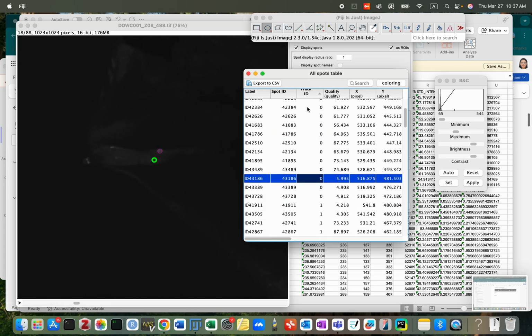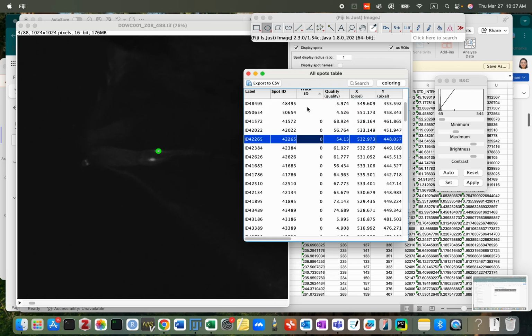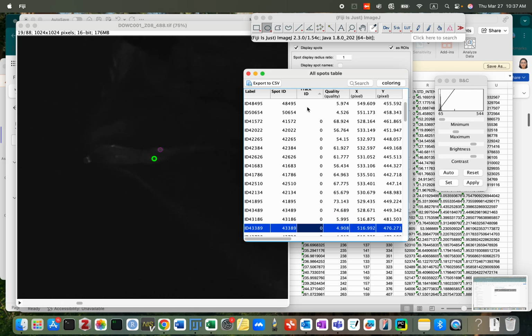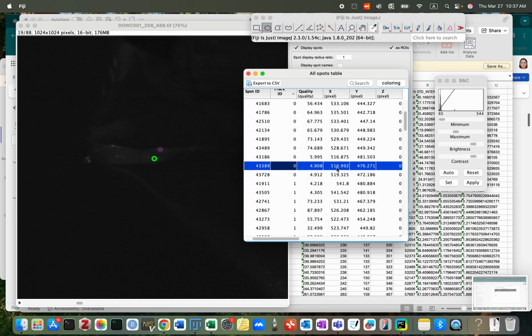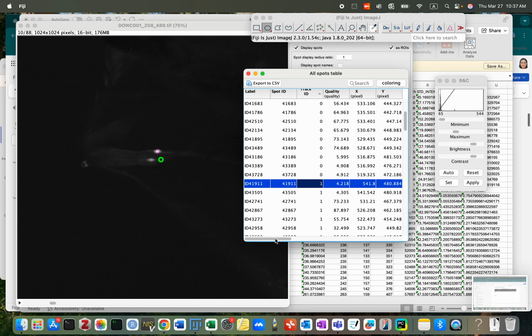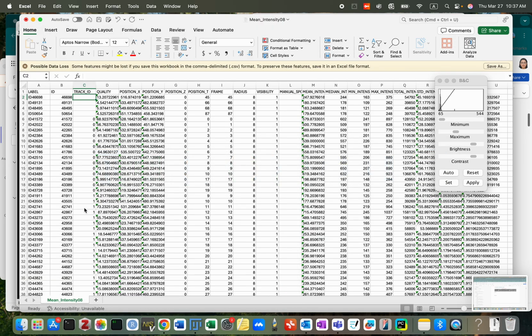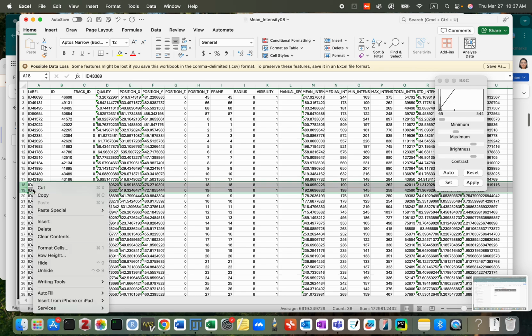Oh, okay, this is a little bit complicated. So 0, 0, 0, 0, 0. This is wrong. And then how many? So 2 neuron 0 is wrong. Okay, the last two, come to your Excel. Last two I delete.